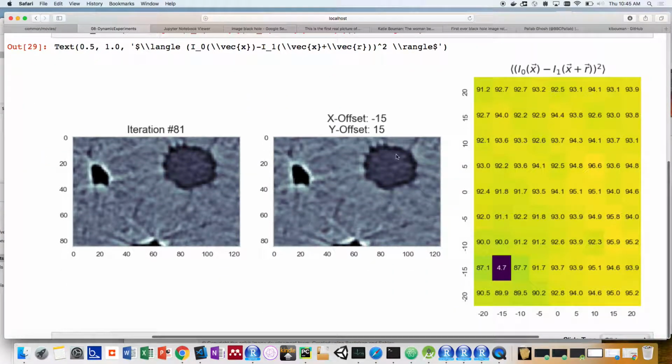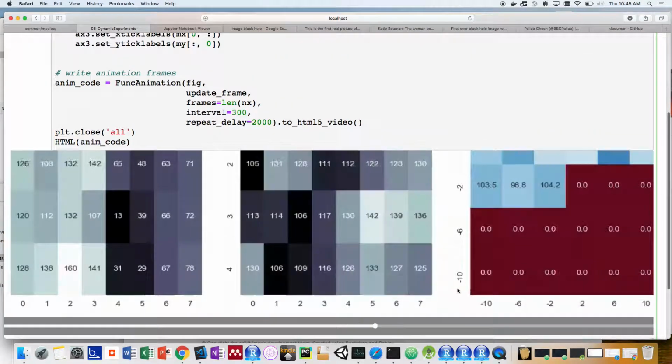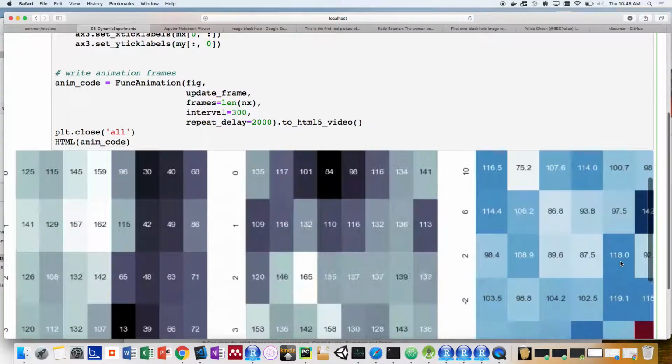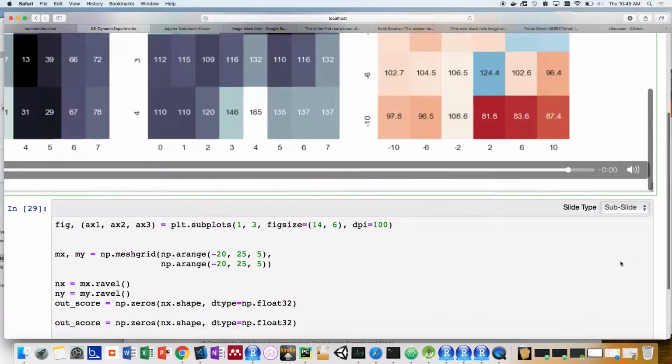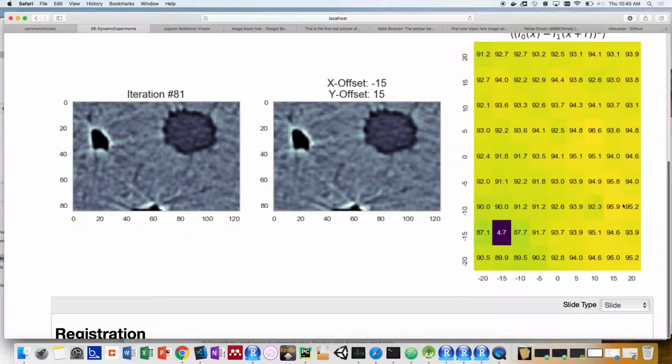And we can find that across this whole grid of points, here we had a fairly narrow grid, from minus 10 to 10, and none of them were clear winners. As we expand that grid from minus 20 to 20, we now see that there's a point where the images overlap best. It's still not a perfect overlap, but it's fairly close. One of these points is significantly different from all the others, and that gives us a reasonable starting point for lining up.